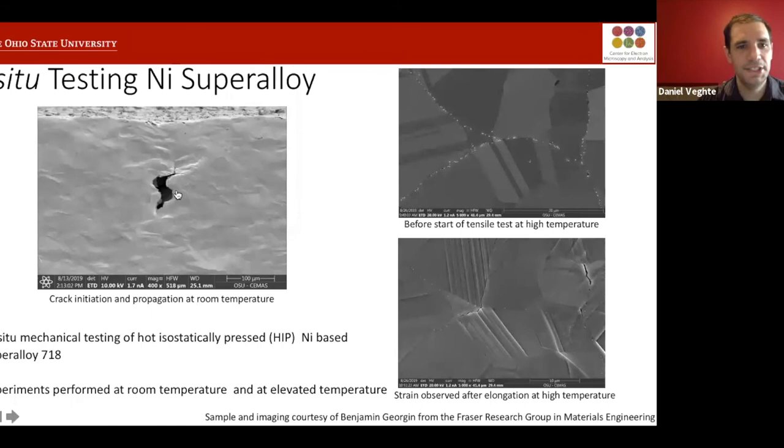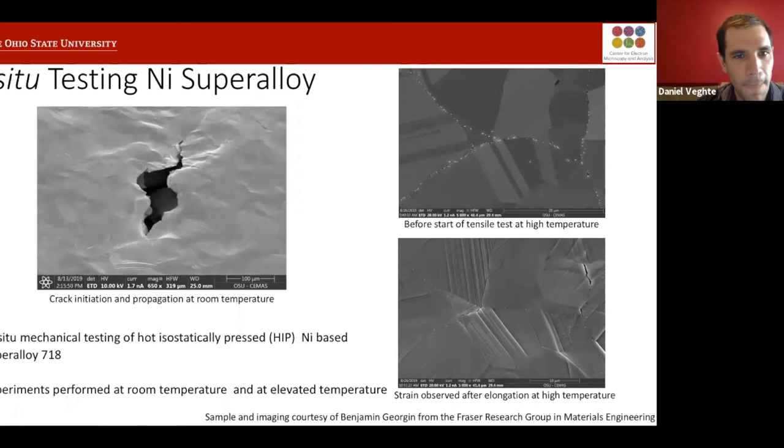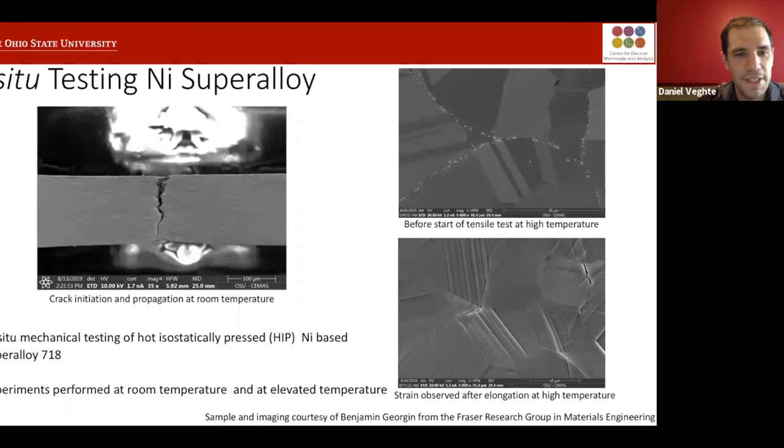Initially, you can see where this crack started to form. And I'm going to play the video. As we apply more strain, you'll be able to see the crack propagation along the top and bottom of this failure point. So you see it's starting to crack on both sides. You can follow along with what's going on with the grains. And then it's nice we're able to just zoom in on what's exactly happening down there. So you get these nice continuous images of all of this until you hit that complete failure point.